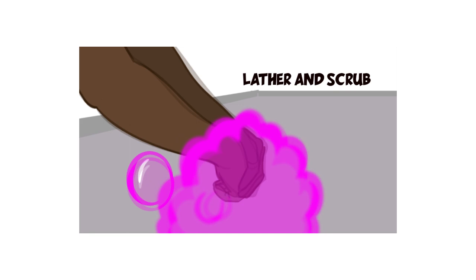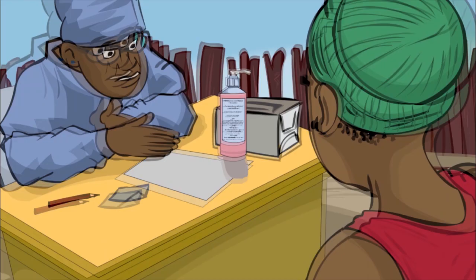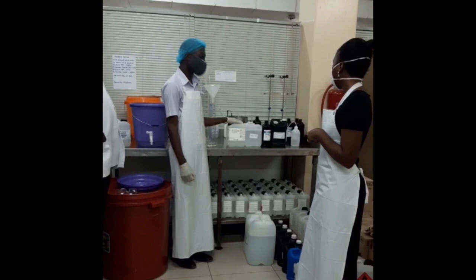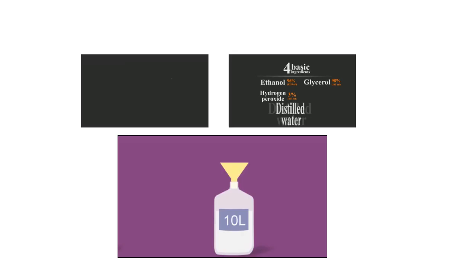To see experiences of Zambian pharmacists producing hand rub and nurses using it in hospitals, please go to the extended version of this video. We hope you have found this short animation valuable and are able to implement as needed.